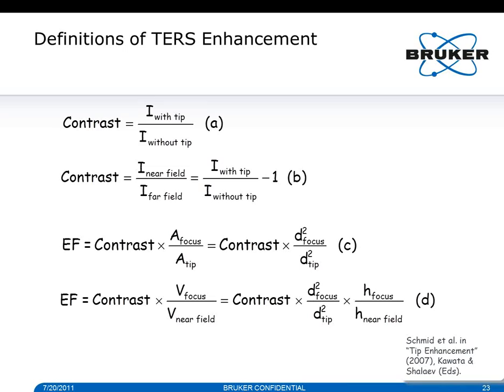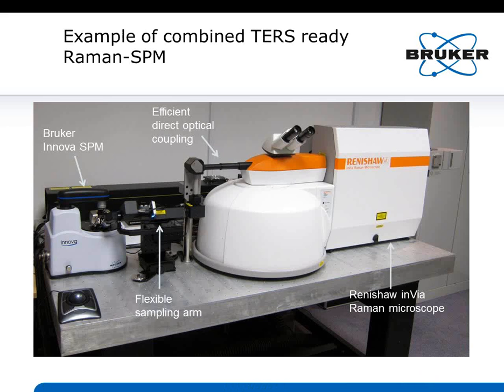How were they defined, and how did people, for example, verify that the tip was really only 10 nanometers or 2 nanometers or 20 nanometers? So again, because of the uncertainty, contrast is a very nice way of stating it. Even though the numbers don't look as impressive, it's completely clear what's actually meant here.